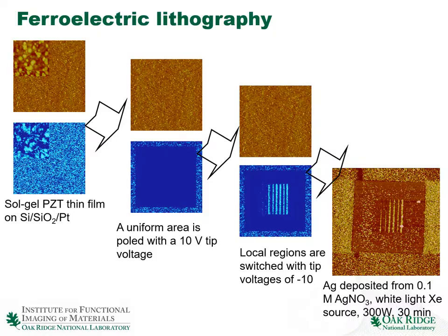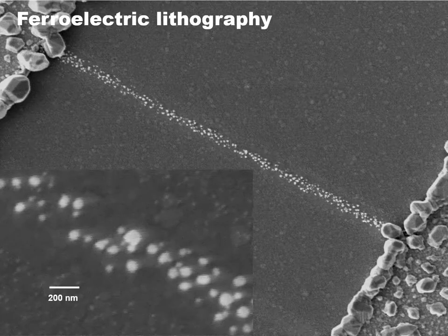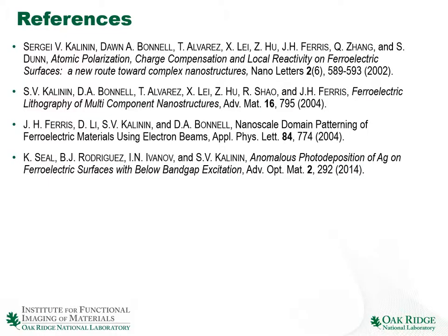And of course, in this case, this is freestanding, but I can also form the pattern of the domain between two macroscopically deposited gold electrodes, and I can create a chain of silver nanoparticles that connect two gold electrodes. This approach, of course, is fairly non-optimized, so we have a lot of silver deposition on the gold electrodes, but as you can see, we don't see much silver deposited between them. So in some sense, we created the pattern exactly where we wanted it to.